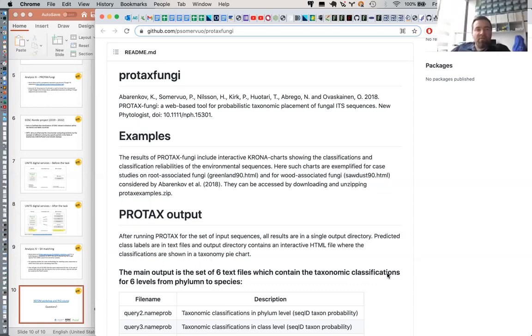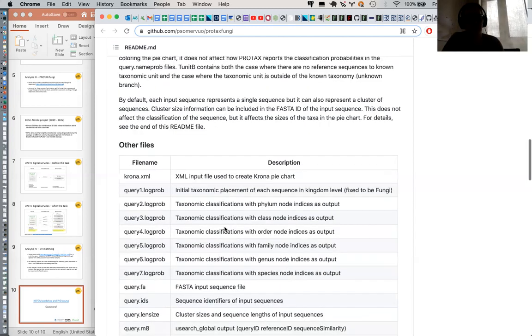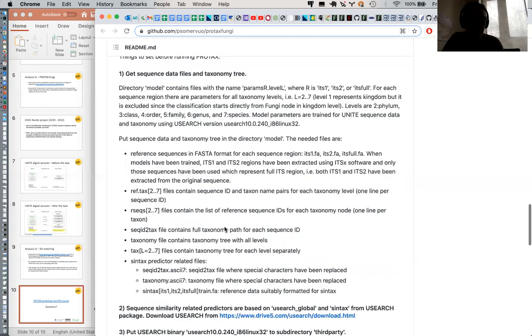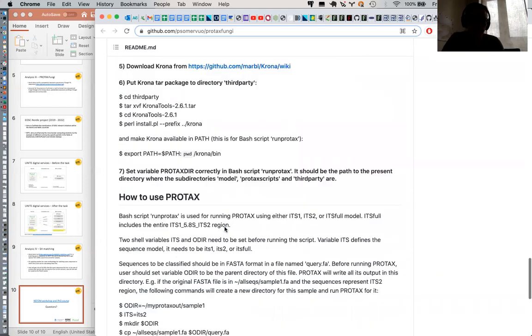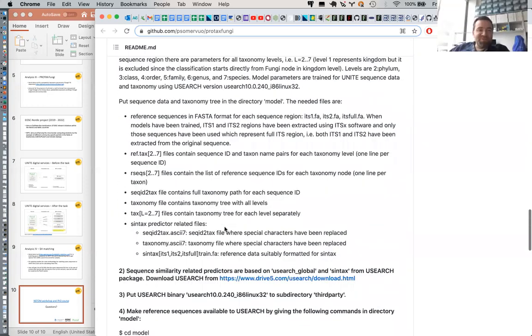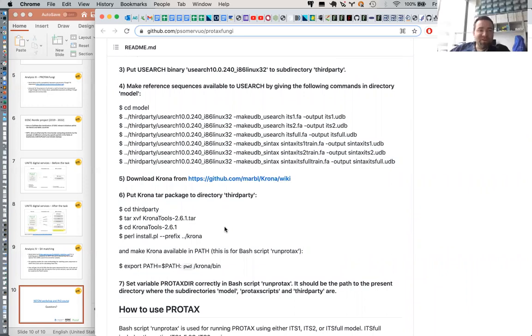Okay. So if I have my own, let's say, classification table from real environmental samples, can this serve as an input? Yes. So there is this GitHub account with the information that you need to process these files. It's just easier to ask, and yes. Probably you can answer many people's questions, because at least potentially it's a useful tool, especially when the limit is more than 1,000 sequences in this case. Yes.